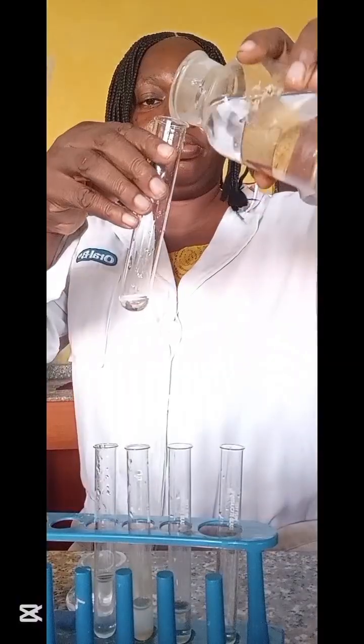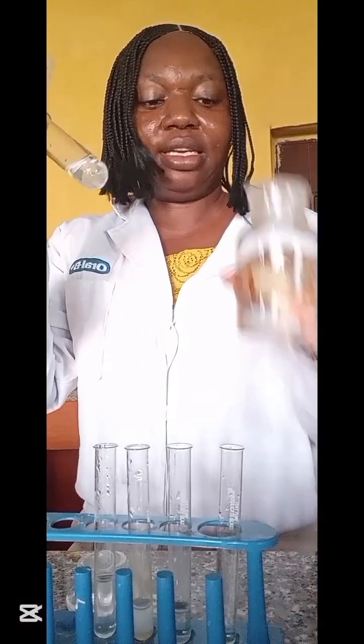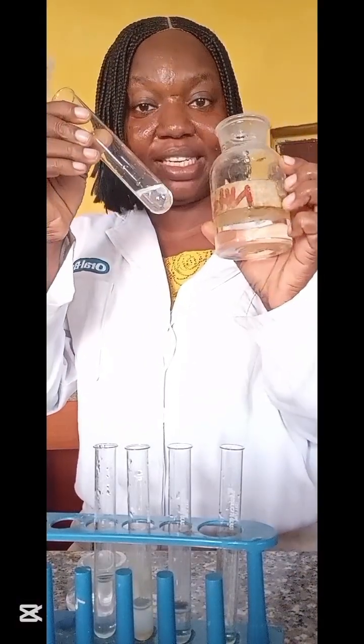Now, in ammonia, if it is calcium, it gives no precipitate in ammonia. That's to show you that it's calcium. If you do all these things very well, you will have no issues. Know what the answers are before, then when you test it, it fits in.